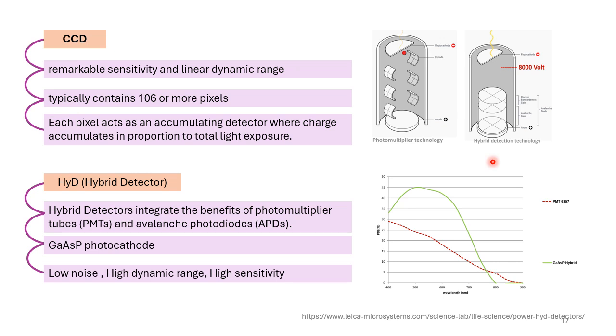low noise. So we know about the avalanche photodiode, which is a photodetector which converts light energy into electrical energy. Here in the hybrid detector, they are using this avalanche photodiode to further amplify the signal and to make the detector more sensitive. And actually this avalanche detector increases the sensitivity, along with it also improves the internal gain mechanism, and it generates a high current.